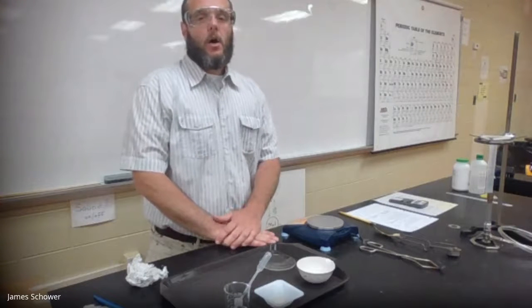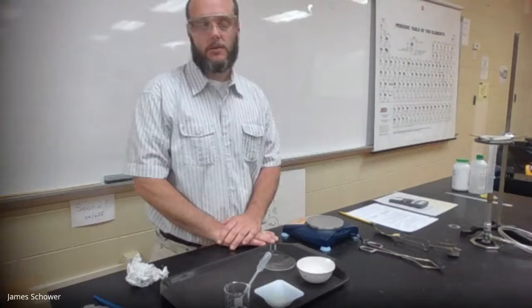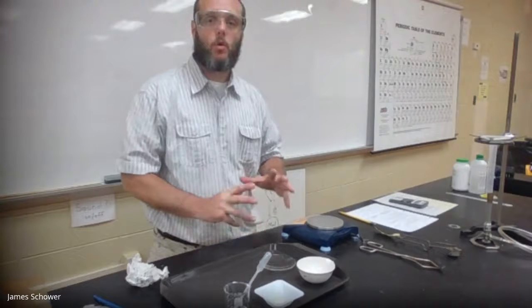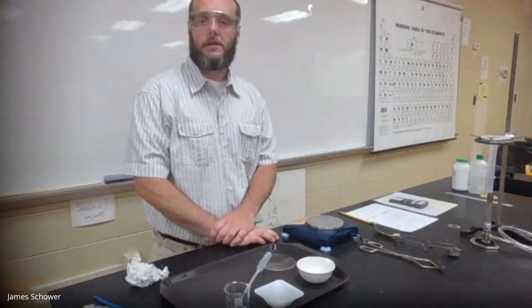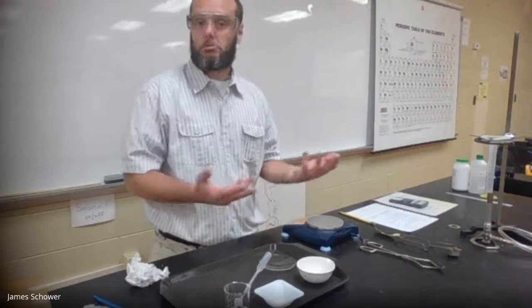Today we're going to be producing a salt, NaCl. We are going to be reacting hydrochloric acid, a moderately strong version, with baking soda, which is sodium bicarbonate. Together, the two of them form salt plus water plus a gas, CO2. The CO2 will be liberated, however, we're going to be left with salt water.